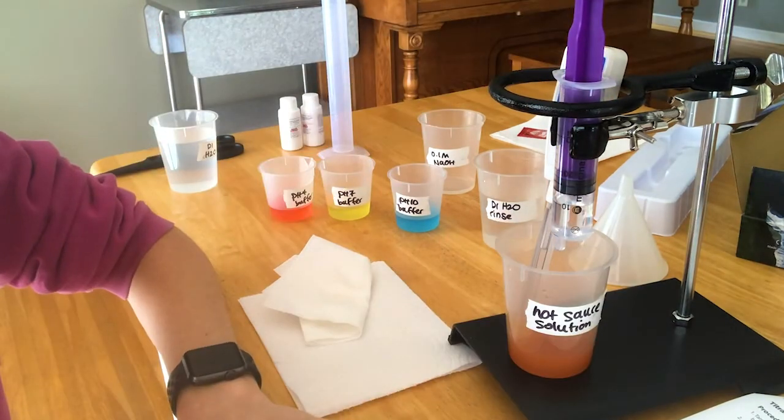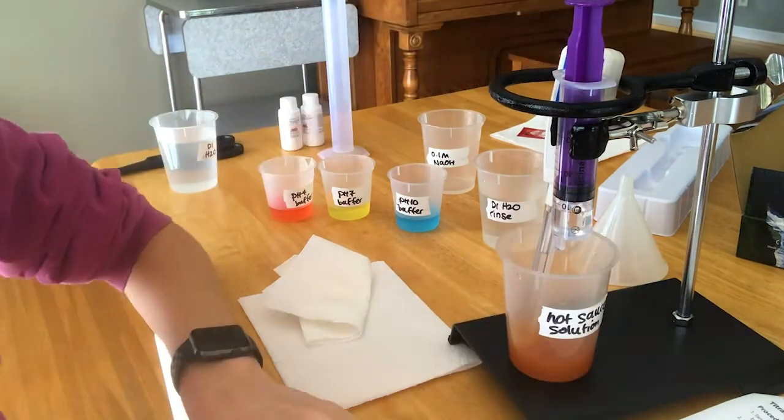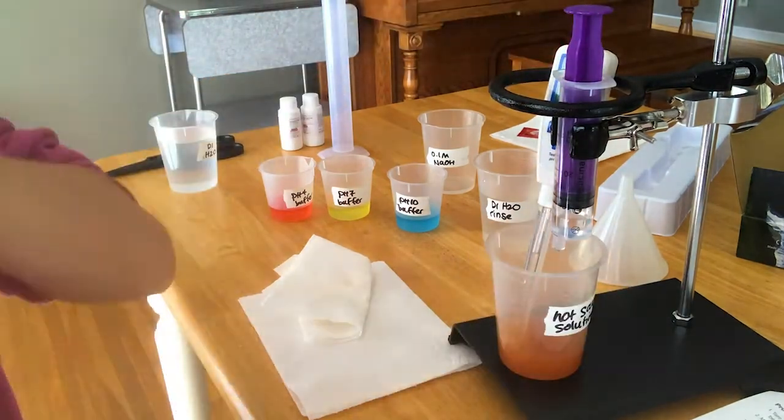If you want to keep your buffer solutions, you can pour them back in the bottle. Everything else can be rinsed down the sink with a lot of water. Make sure you rinse off your pH meter with distilled water and then put it back in the salt solution for storing.